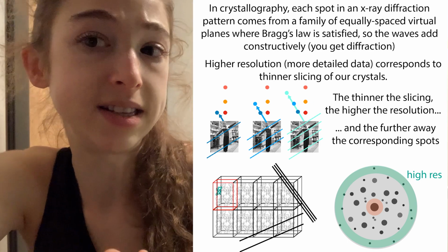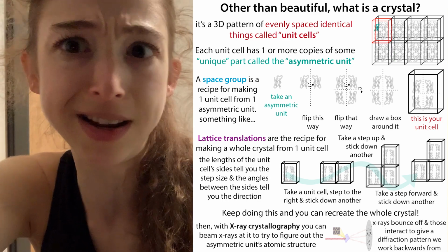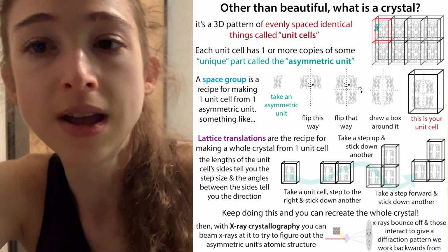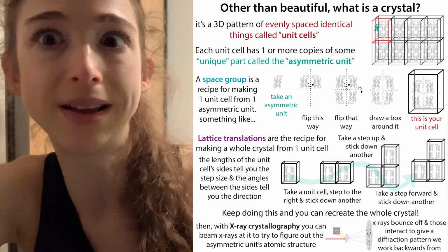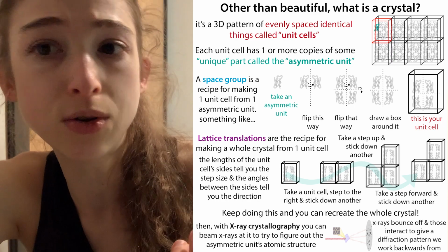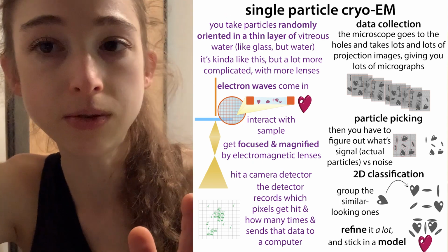But bottom line is, having them all in that same orientation is really important, but you only get them in that same orientation, and often proteins don't really want to sit still like you want them to in a specific orientation. And even if they do, that might not be the actual most biologically relevant orientation. Proteins, they like to move around. And so another technique, cryo-EM, would say, okay, you move how you want to move, and we'll just freeze you in place however you are.